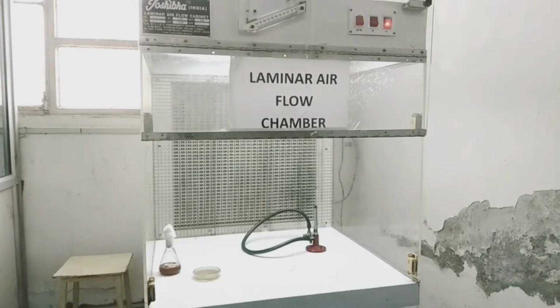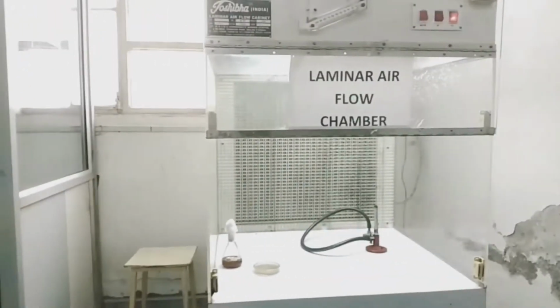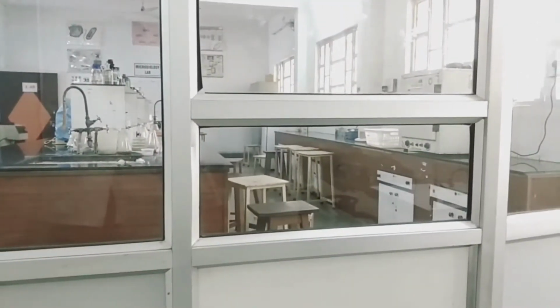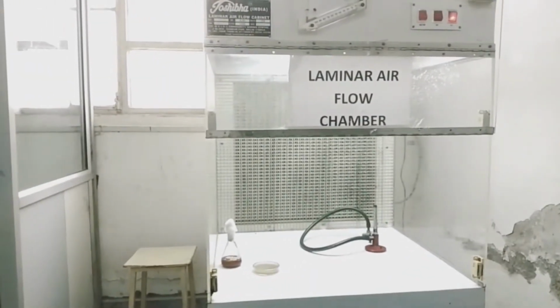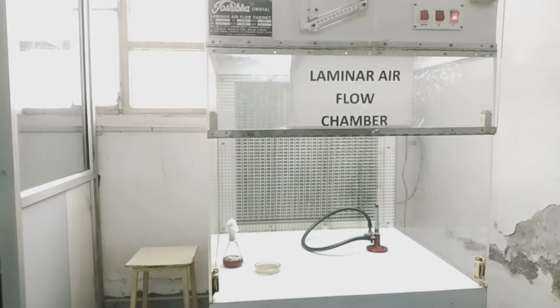Why is it written laminar airflow chamber? Because this is a special thing that you can see: the total laminar airflow is covered with a glass chamber. Means that it is totally isolated from the laboratory. You can see that outside is the laboratory, but this chamber is totally isolated from everything present in the laboratory. So that provides a sterilized condition, because airborne contamination also doesn't enter inside it. And now we are going to see how it works and how we have to work on it.